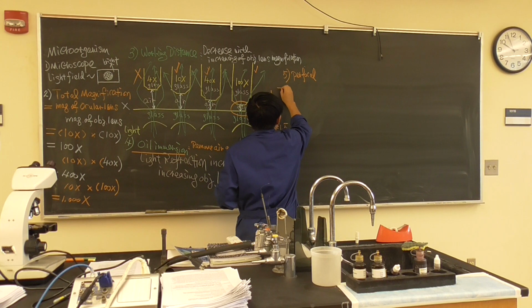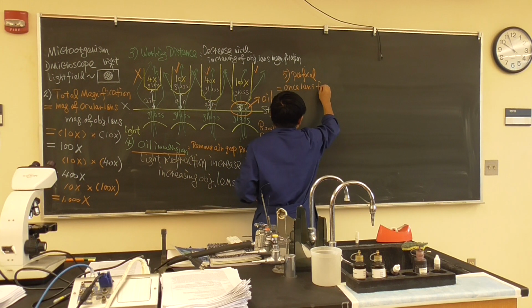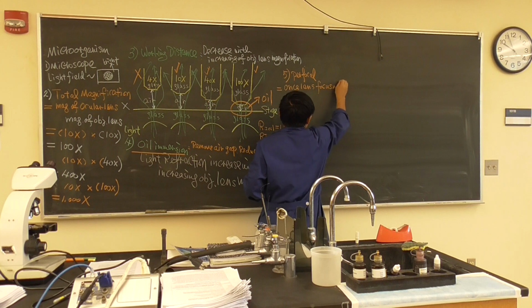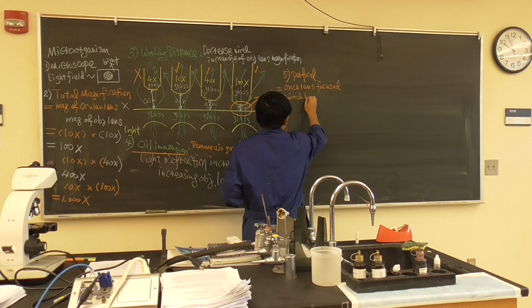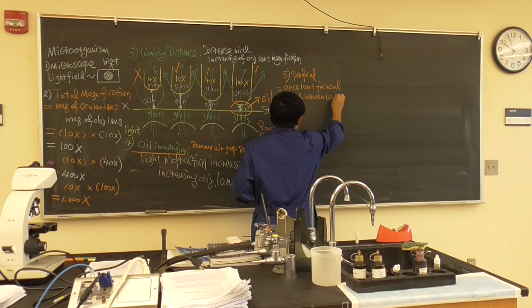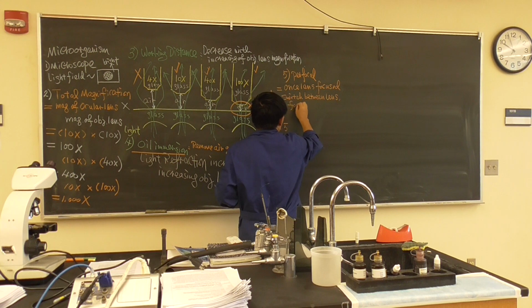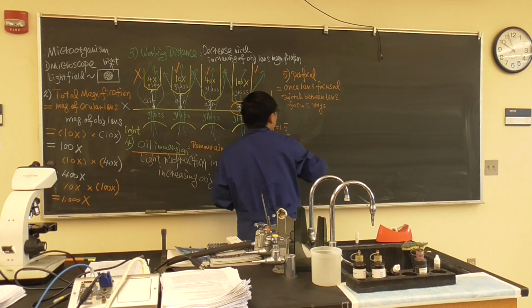Very simply said, once the lens is focused, switch between lenses, the focus stays.